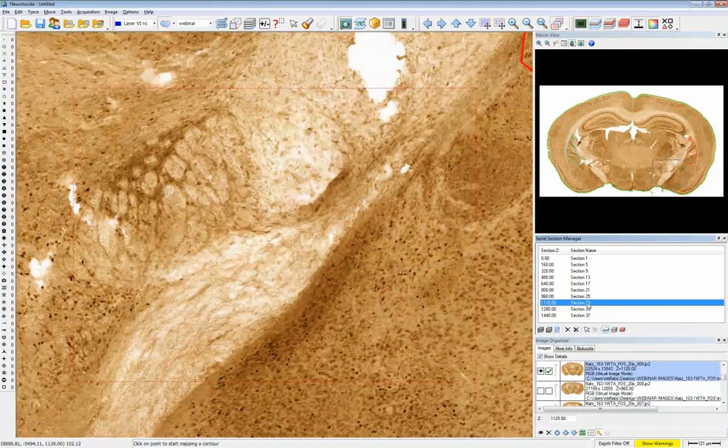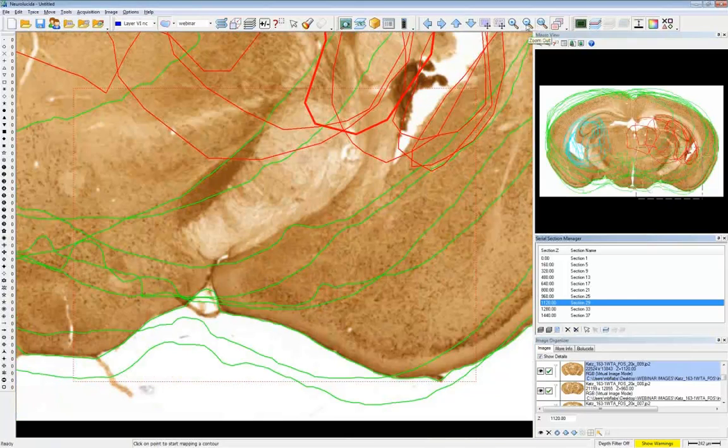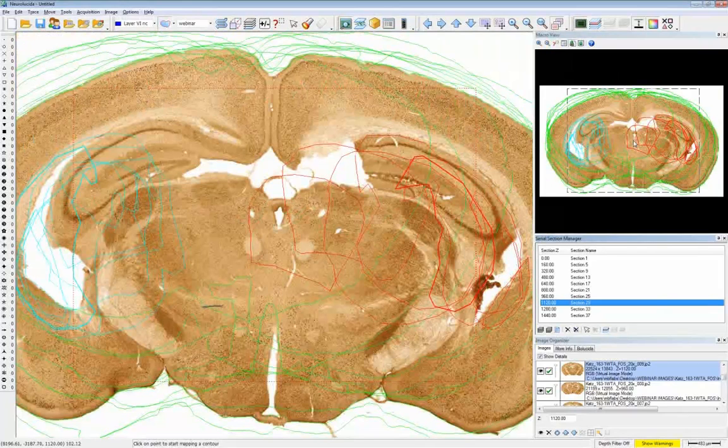So that registration is a really handy tool. While we're here, I want to show you another new feature for version 11 that makes editing quite a bit easier. Let's say that you are happy with your reconstruction, you love it all, except aqua is not the color that you want to use for a publication.